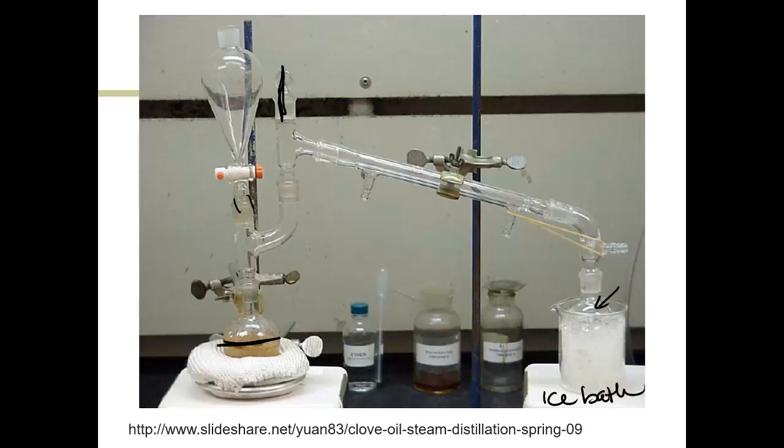It will create a pressure to pull the liquid over. It will also allow the distillate to condense down into the flask. So you're going to use water with your stopcock to add water and keep your level correct. Now, we do have some clamps to help you clamp everything together. Just make sure that they're returned if you need them. You may not need them. You may also have rubber bands if they're available. Sometimes the rubber bands disappear, so don't bank on them.